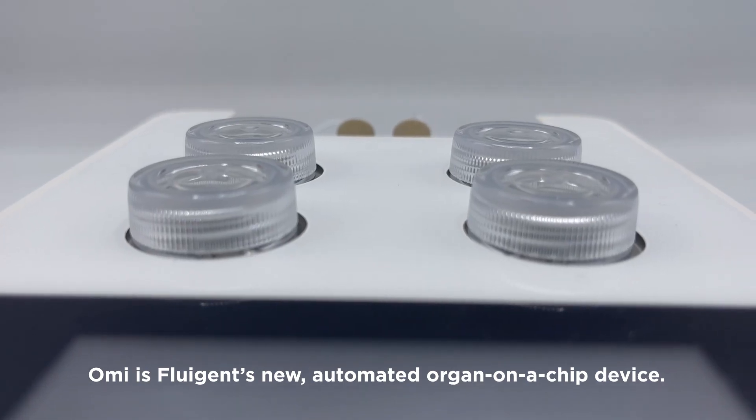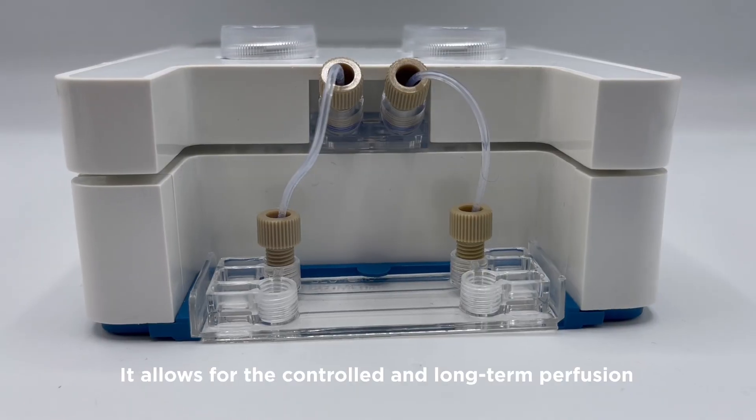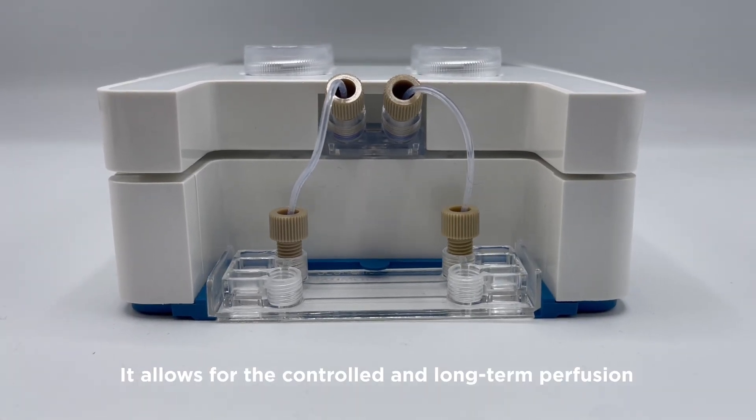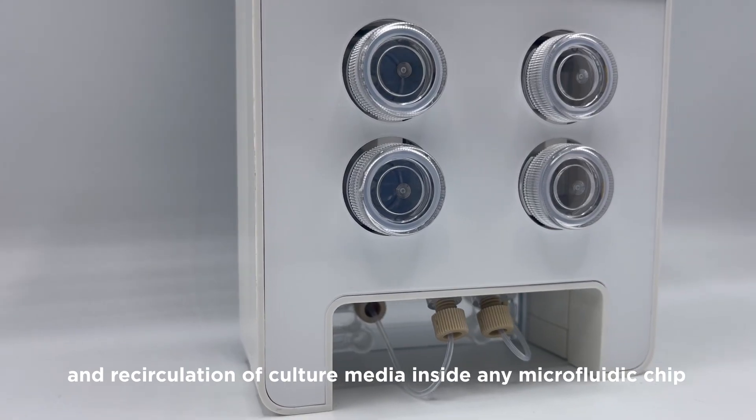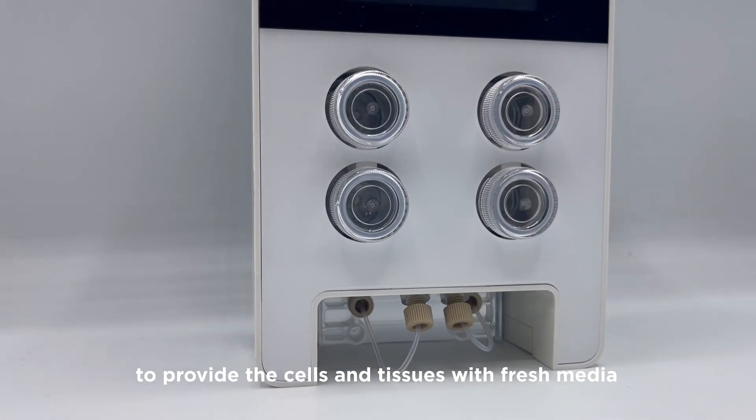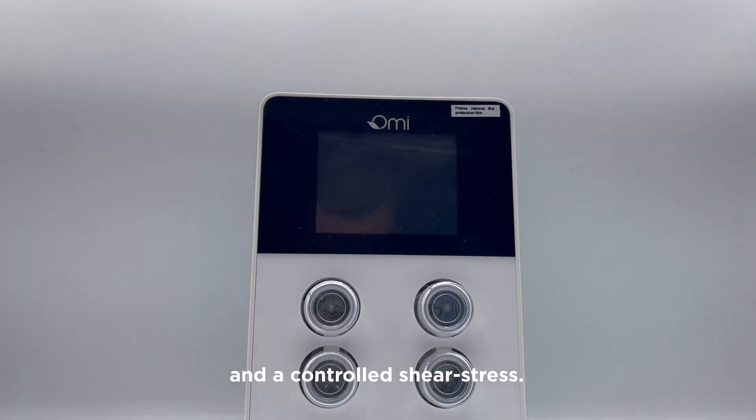OMI is Fluigent's new automated organ-on-a-chip device. It allows for the controlled and long-term perfusion and recirculation of culture media inside any microfluidic chip, to provide the cells and tissues with fresh media and a controlled shear stress.